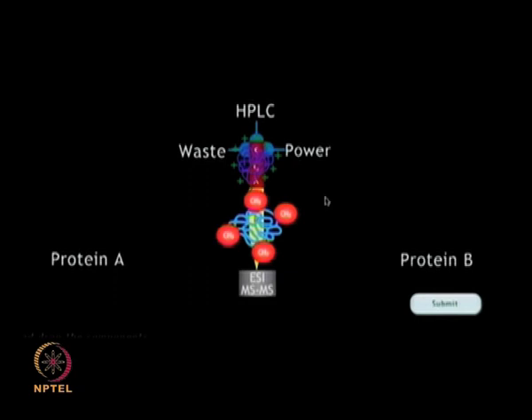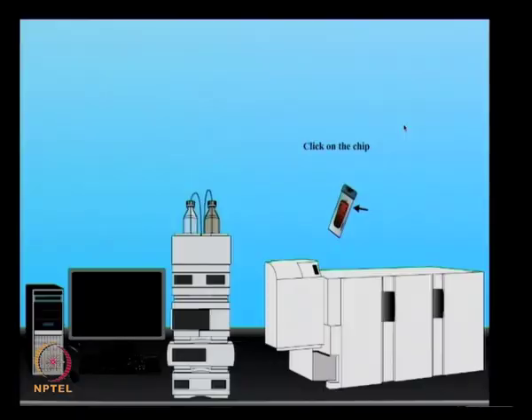The MudPIT technique allows greater separation of peptides, which can directly be interfaced with a mass spectrometry ionization source. It also avoids band broadening, which is one of the drawbacks of many chromatographic methods. We have discussed different types of liquid chromatography systems. In a traditional nanoflow LC-MS system, several fittings and connections are required, which is one of the major limitations of using those traditional systems.